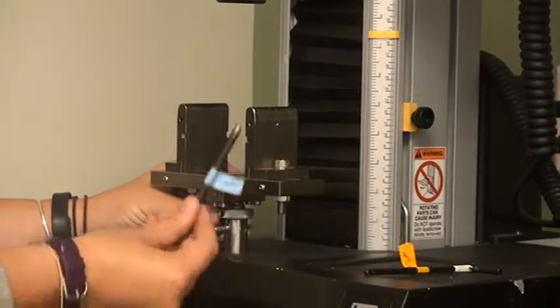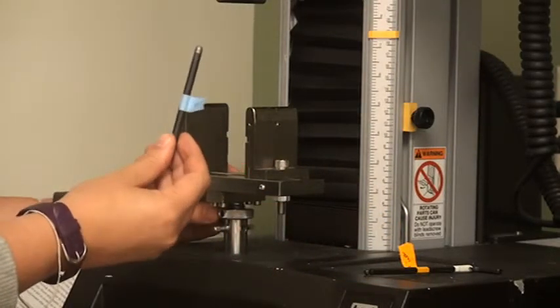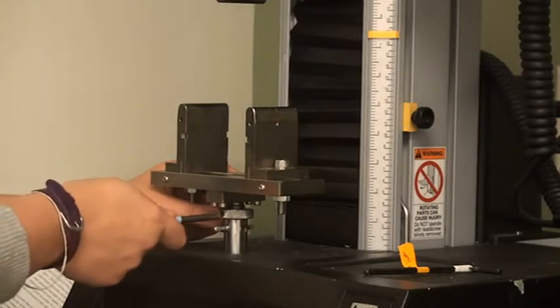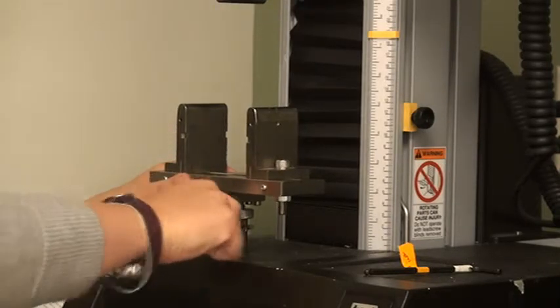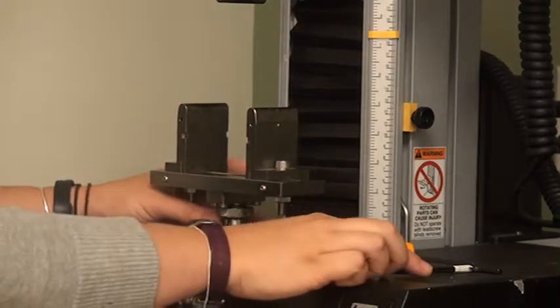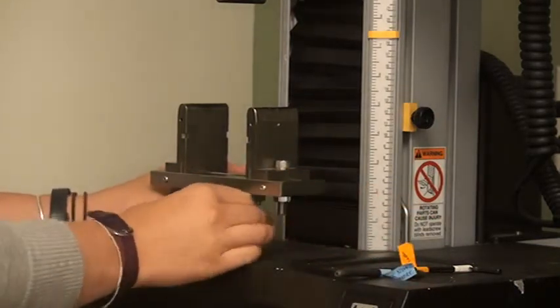If the lock nut is very tight, you can use the lock nut tightening tool to help you unscrew it. Insert the tool into one of the holes on the lock nut and unscrew until the lock nut is flush against the bottom face of the grip.